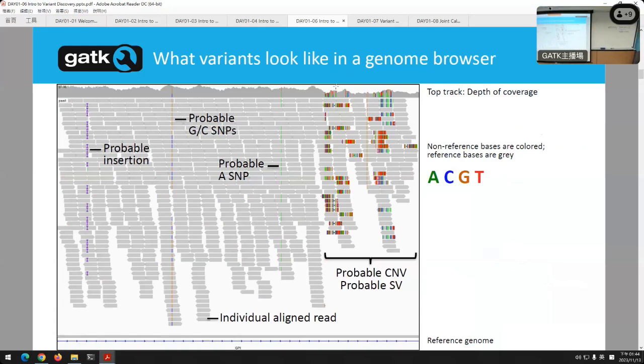Maybe a little bit over to the right, you see the brown and blue column. That means there's both a G and a C, and neither of them is the reference base, because they're both highlighted. That's what it would look like when you have a heterozygous SNP. Heterozygous means your genotype is different: there's one C and one G, not 2 C's. Versus homozygous, which means both copies from your parents are the same allele, the same letter.